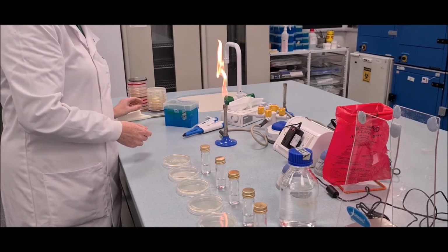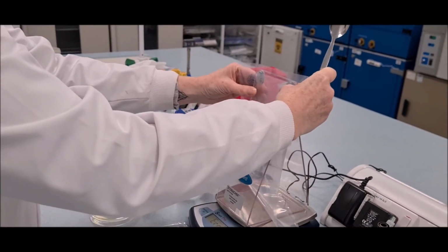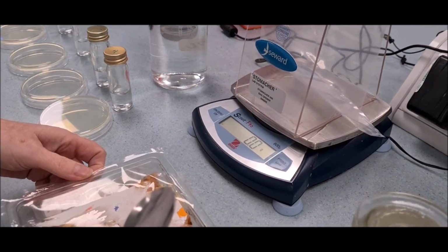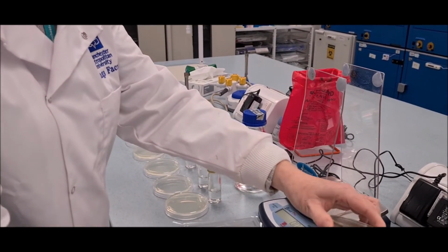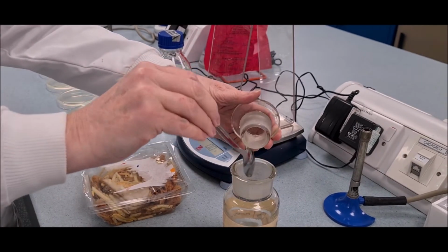The food is sampled using the following procedure. 1. Aseptically place a stomacher bag into the stomacher bag holder, place on the balance and tare the balance. 2. Sterilize the spatula or spoon and take a sample of at least 10 to 20 grams of the food sample.